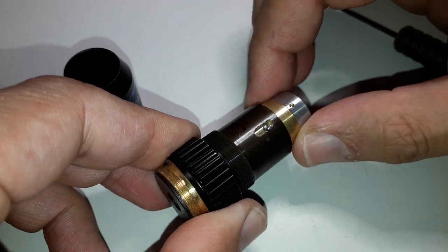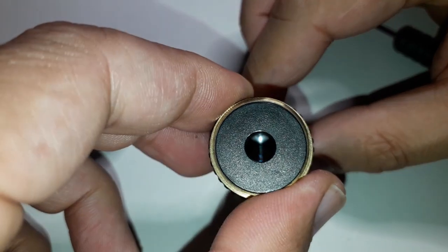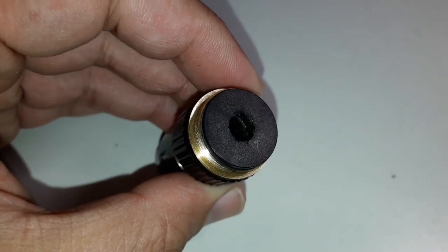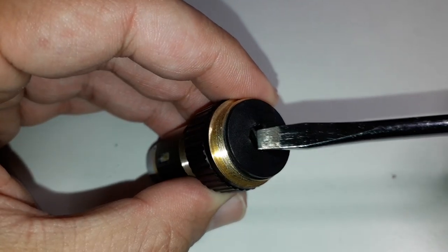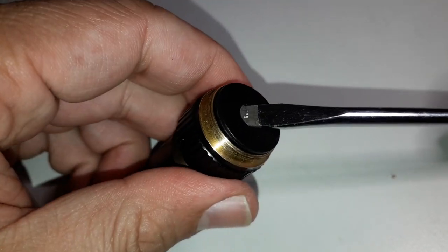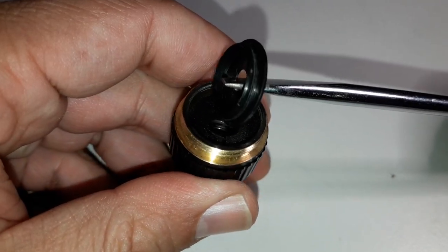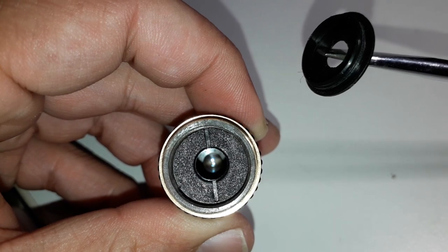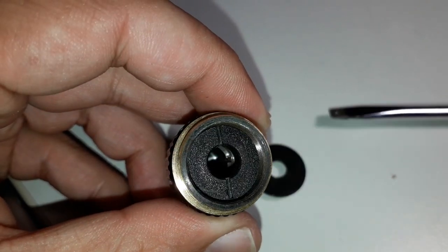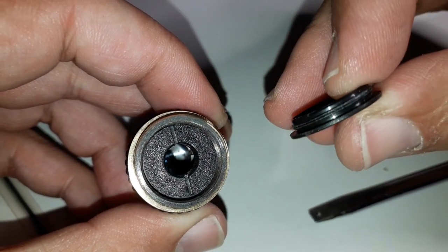It took me a few minutes to actually figure out how to proceed, until I found out that the back part here is actually a plastic cover. So I simply used a screwdriver to pry it off, and it went off quite easily. This gave us access to the inside part of the objective. That's basically the plastic cap — it was simply there as a protective covering, but I think it did not really fulfill any meaningful purpose otherwise.